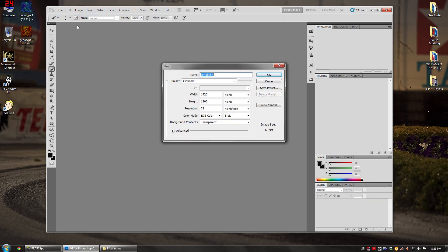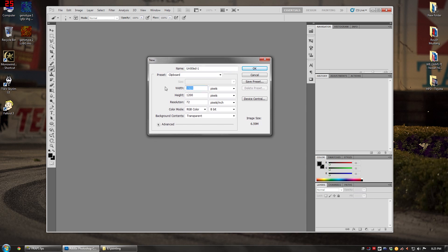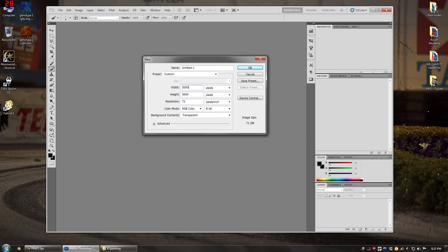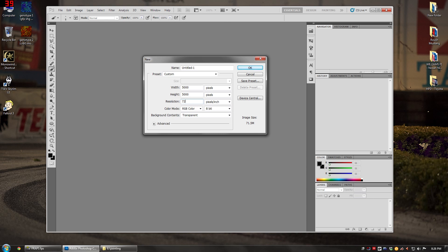First, go to File > New to make a new canvas. I personally make a fairly large canvas — around 5,000 by 5,000 pixels — and then crop it down after. These images are 512 by 512, so that's plenty big. For presentations, 72 pixels per inch is more than enough; for publication or posters, set it to 300.